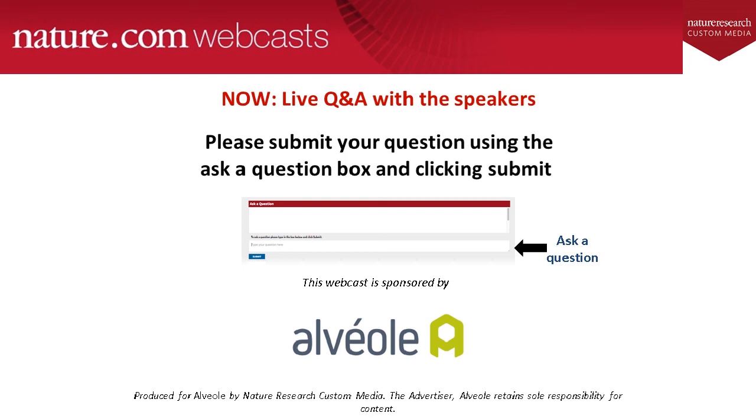And then there is a paper, I think also from Chris Chen, where he limits the area of the micropattern and shows that cells are not viable below a certain size. And there are a number of papers comparing focal adhesion density to micropattern area, to all of these different things that are going on when you plate a cell on a micropattern. So you do need to keep all of these things in mind and then design your micropattern so that it answers your biological question. Yeah, so I hope I answered that question.